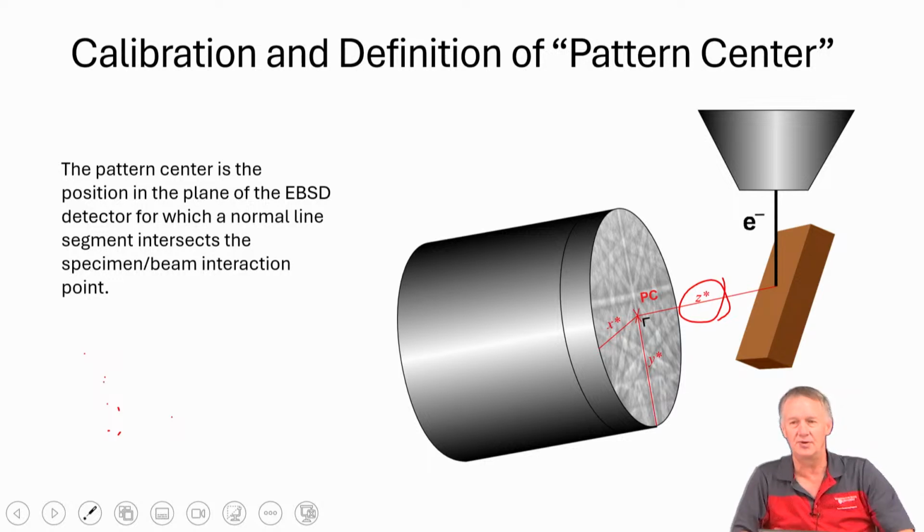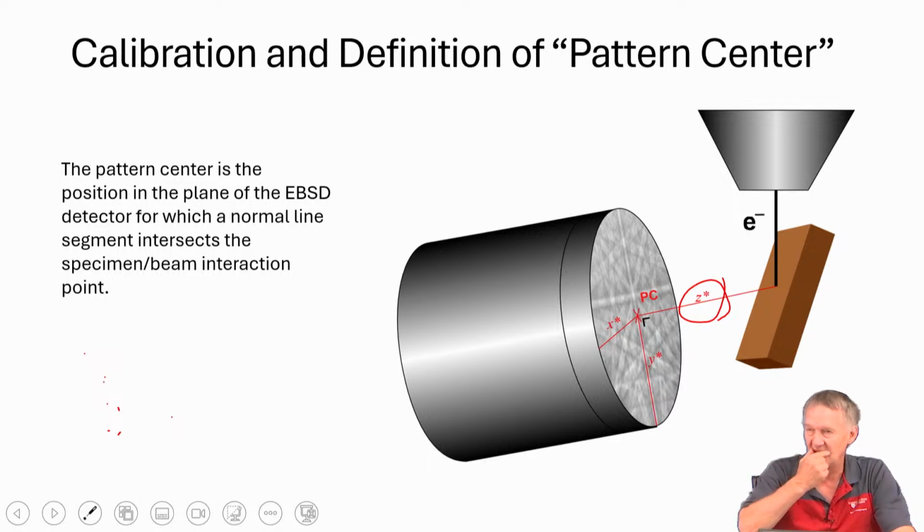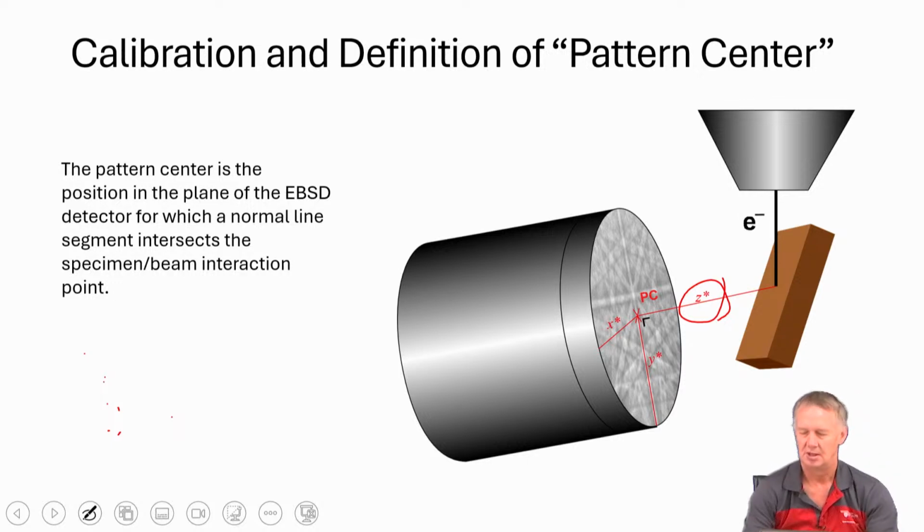And it's all based around the gnomonic projection that happens with EBSD patterns. One of the things he did, which was kind of educational, I think, on how the pattern is produced, is he took, let me try and draw this again, bear with me. He took and put what he called pawnbroker's balls. So it's 3 little balls that are in different positions. He hung them off wires at the top of the chamber, little fishing line. So there's a little ball here and a little ball here and then a little ball over here.